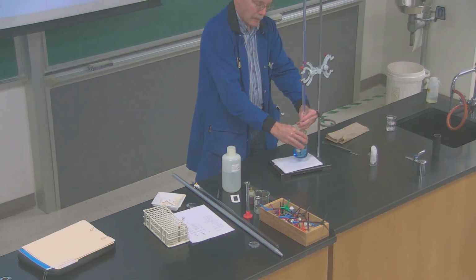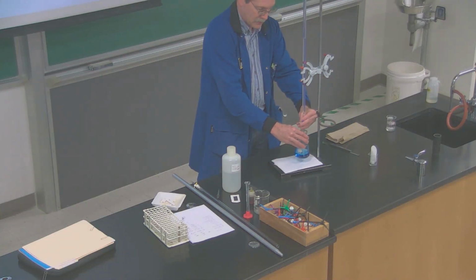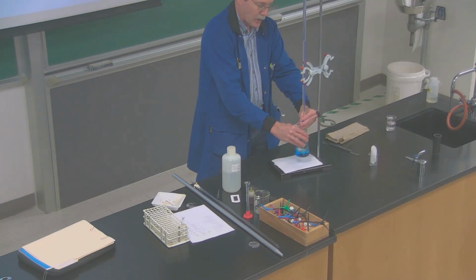With the phenolphthalein and the acid-base one that we did, the end point was very sharp. You went from a colorless solution when it was acidic until that one drop of the sodium hydroxide could convert it to pink. In fact, if you're really careful, often you can get it with just half a drop. You get it to the point where it's very faint, or pink is almost persisting, and then you can just wash a half drop that's hanging off the bottom of the burette to get that last one in.